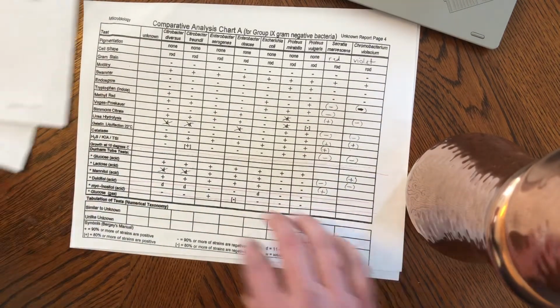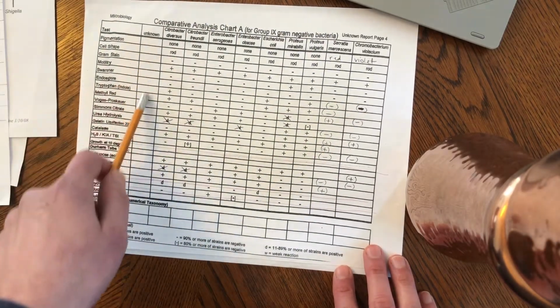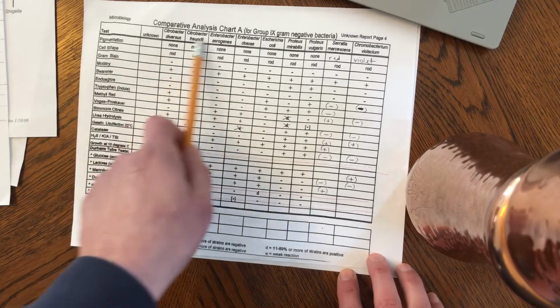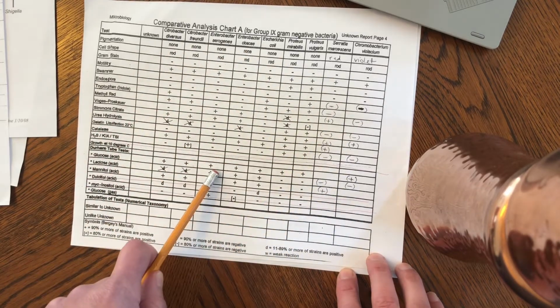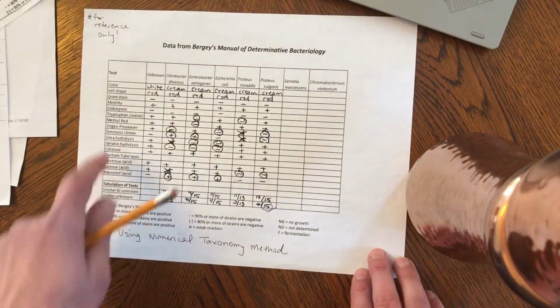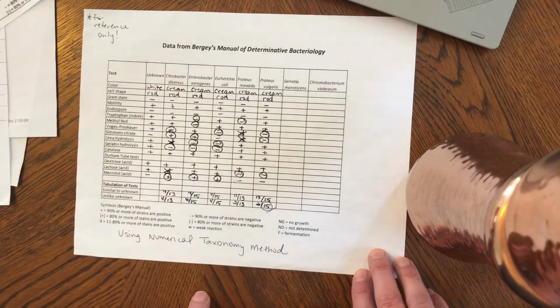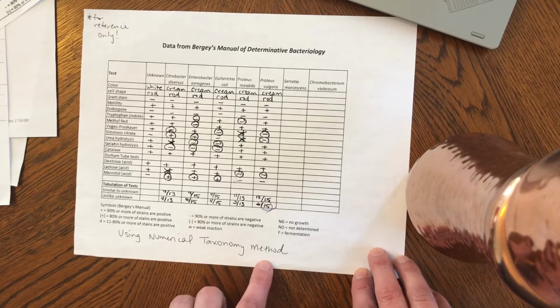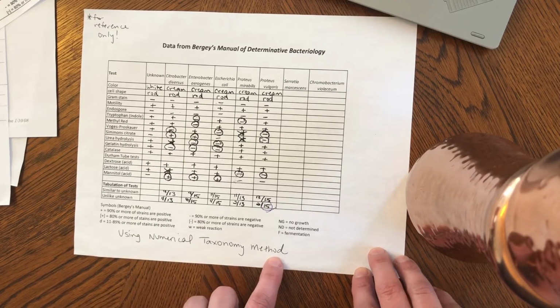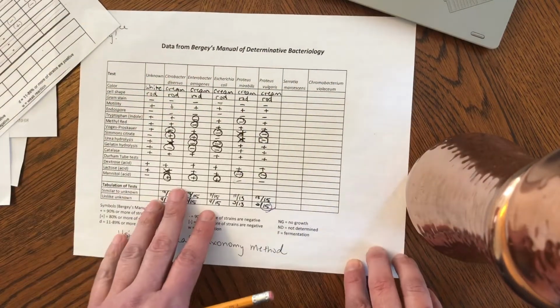So ideally, you're going to go to your descriptive chart and write all of your test results here. And then you're going to compare the test results that you can match here with the ones here, okay? You're also going to be getting a handout I have written here for reference only. I would have given this to every single one of you so you could understand how to do what's called the numerical taxonomy method. So only those of you that end up in group 9 will actually have to fill this handout out, and you'll use this for reference just in case.